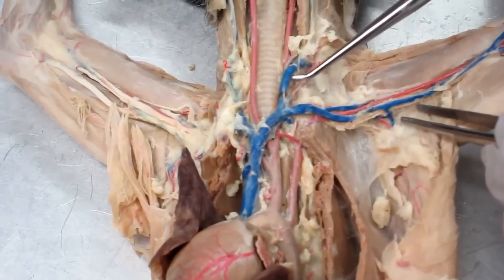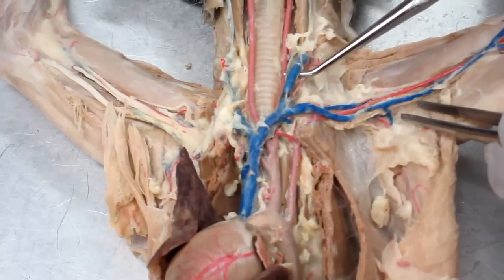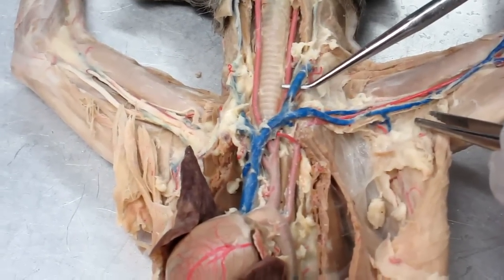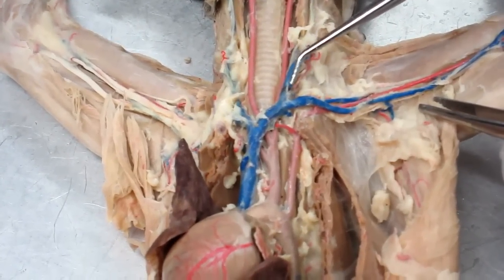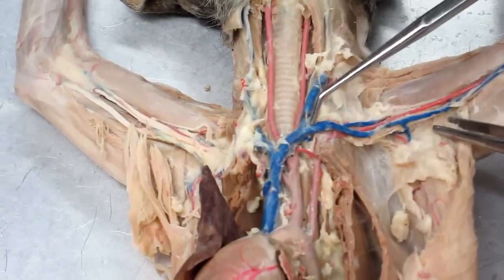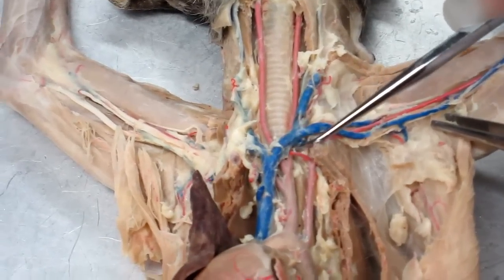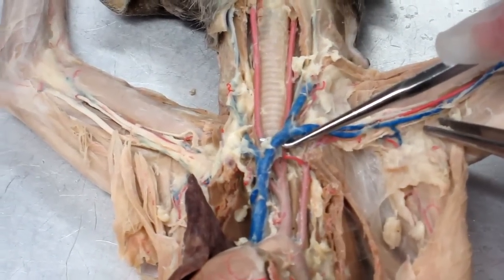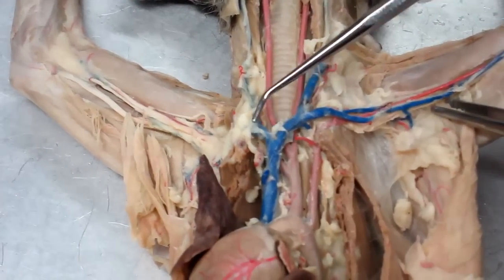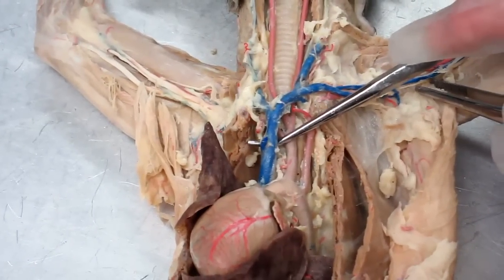And then joining the subclavian vein, we have the external jugular vein. Okay, that's another one of the differences that we have in the cat compared to the human. If you remember, in the human, it was the internal jugular vein that was large and was joining to the subclavian at this location. Okay, these two come together to form the brachiocephalic vein. We have one of those on each side. The two brachiocephalic veins join together to make the superior vena cava.